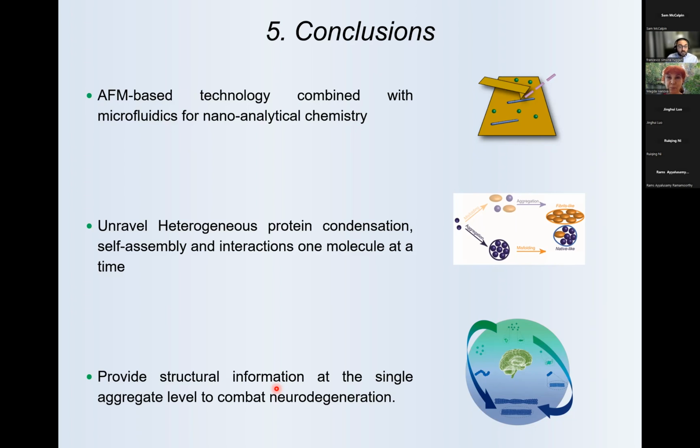Yeah, first of all, any technique can be useful. There also exists the equivalent of nano-IR, that is tip-enhanced Raman. The problem with tip-enhanced Raman is that there are a few key points. It is a scattering-based technique, and for reasons that are still not clear, the amide band 1 of proteins is not always present in the nanoscale spectra. Sometimes it appears, sometimes not. And this is clearly a problem when we want to have a structural characterization of the cross-beta sheet signature.